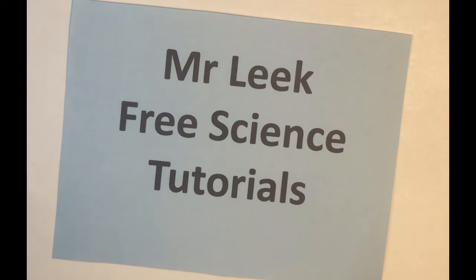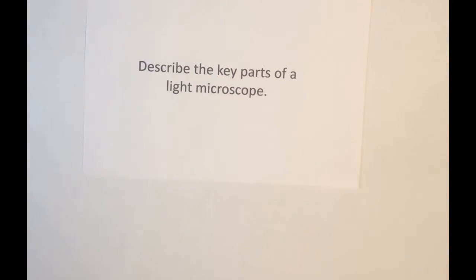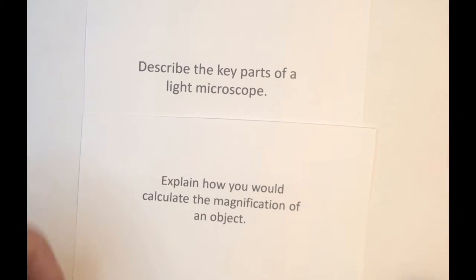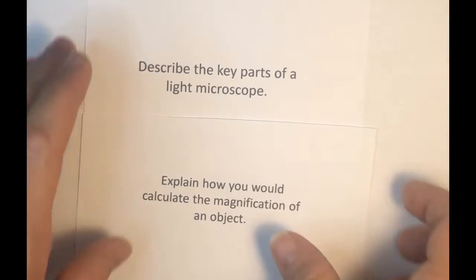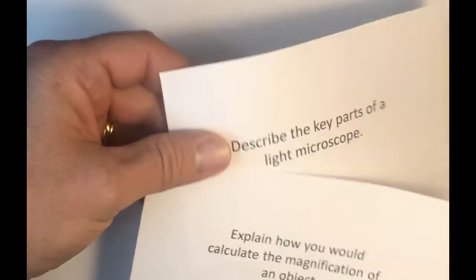In this video, what we're going to do is look at microscopes. And we're going to be answering two questions. The first question is: describe the key parts of the light microscope. And the second question is: explain how you would calculate the magnification of an object. Very, very common questions, particularly the second one, to come up on your GCSE exam.